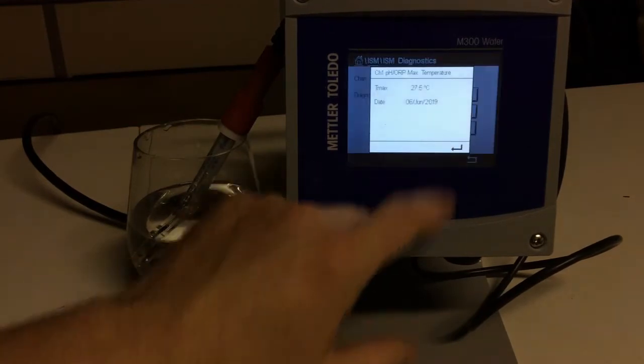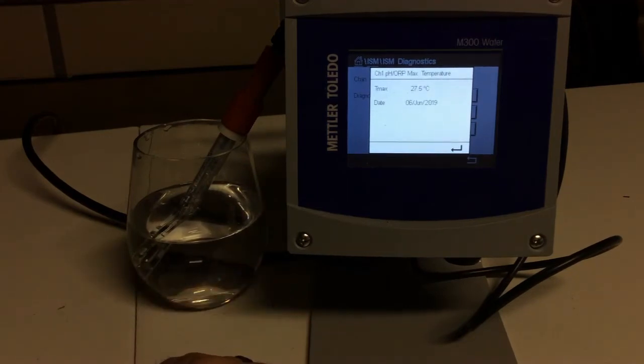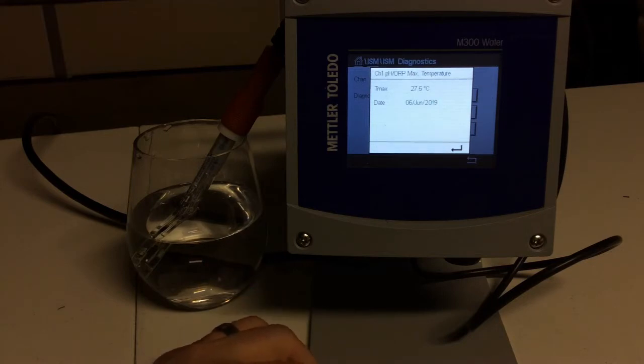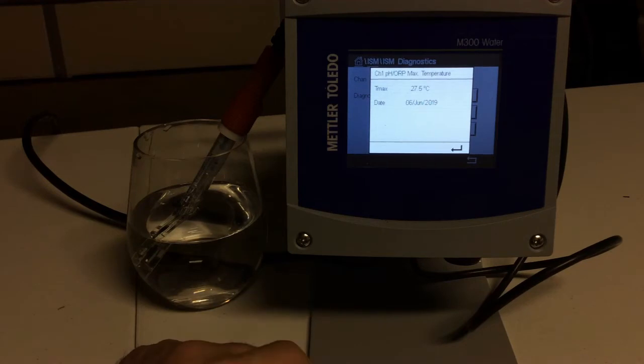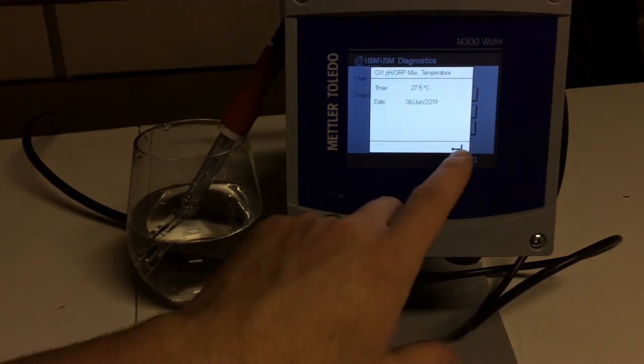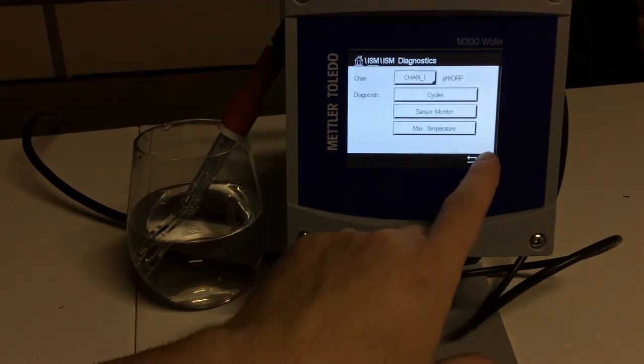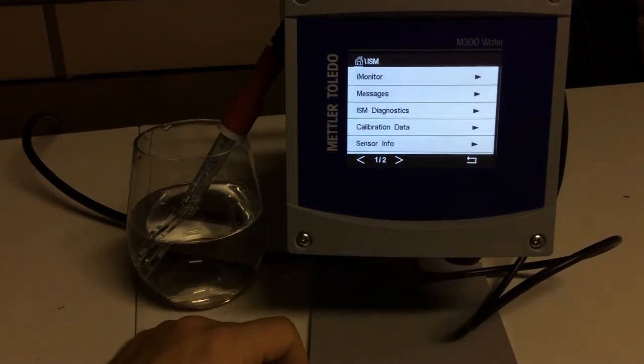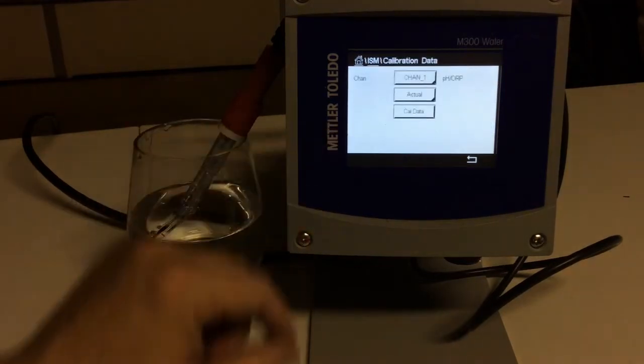The other cool thing it stores is its max temperature that it's seen. And that's important, too, because let's say somebody were to steam out a line and run a temperature past that sensor that is out of its spec range. You can know, then, if that sensor has been damaged by that heat.